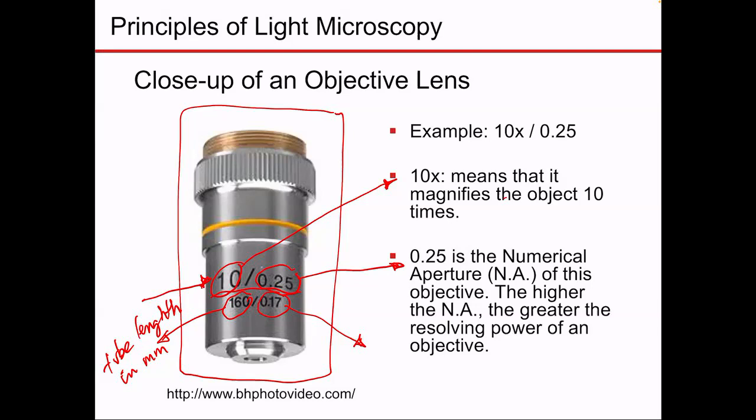So this is the thickness of the glass cover slip, once again in millimeters.